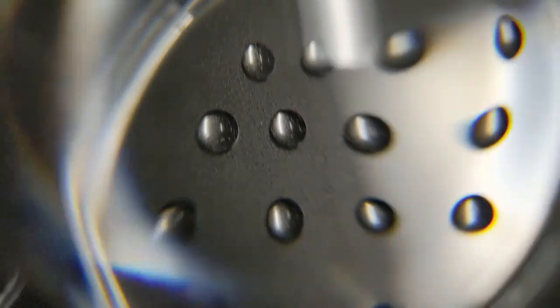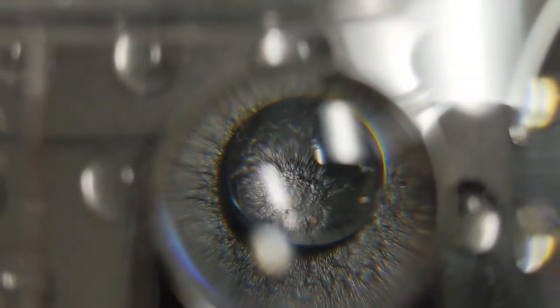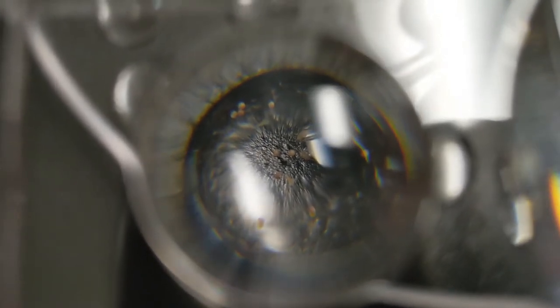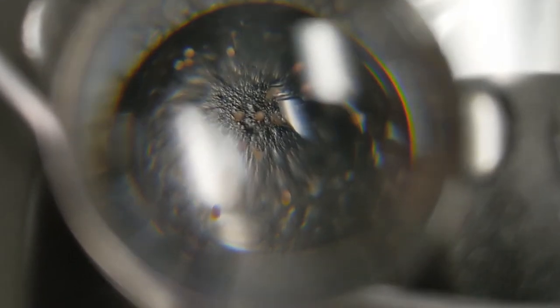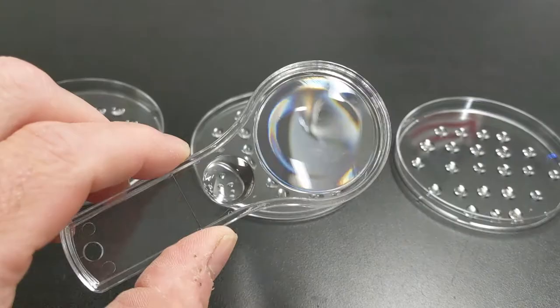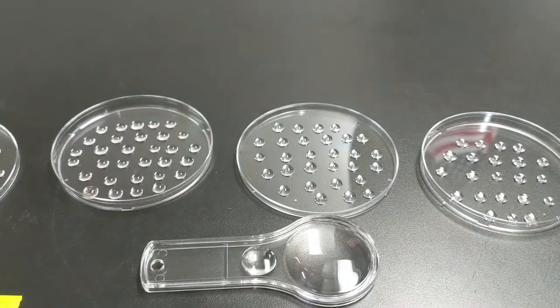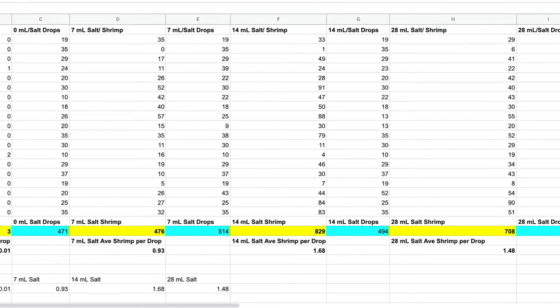Let's have a look and see how things worked out. We'll investigate each sample for the presence of brine shrimp, look inside each drop, and count the number of shrimp per drop to get an average shrimp per drop. For each student, we'll get the total number of shrimp and total number of drops per sample, so we can get a class-wide average of shrimp per drop as well. Science grows by communitarian interest and we're a big team of scientists.